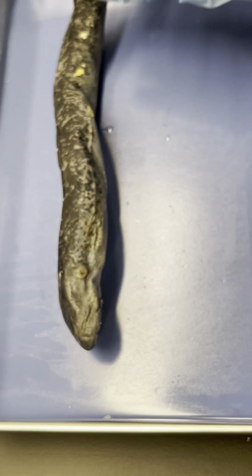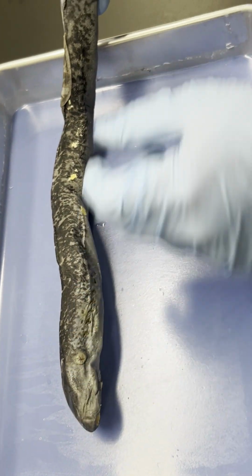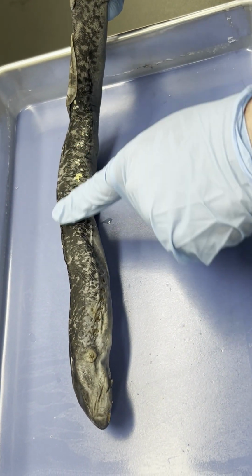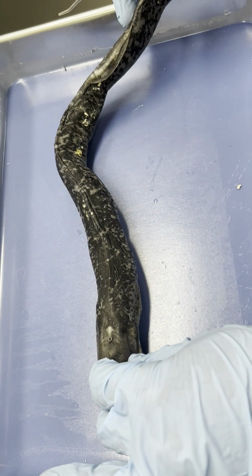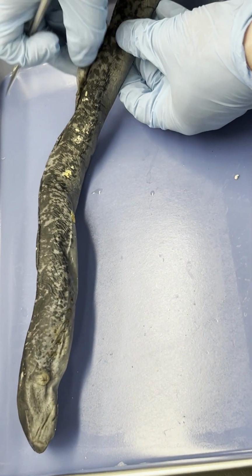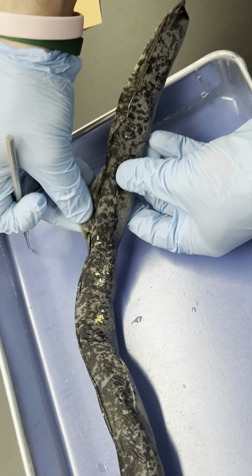The other external structures that we actually see, it's the entire trunk of the animal. So the trunk of the animal is basically its body. We're not counting its head. We're not counting its tail, which is towards the end here. This entire section right here is its trunk, okay? Other external structures that I want to go over are the dorsal fins. So here are the 2, lampreys have 2 dorsal fins. Dorsal means the top, so here's one right here.